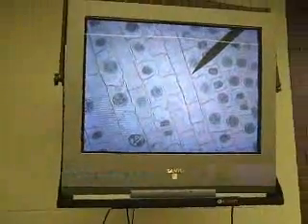After prophase comes metaphase. Metaphase is pretty easy to recognize. During metaphase, all your double-stranded chromosomes will line up in the middle of the cell. They're getting ready to separate and pull apart. Let's see if we can find some metaphase.